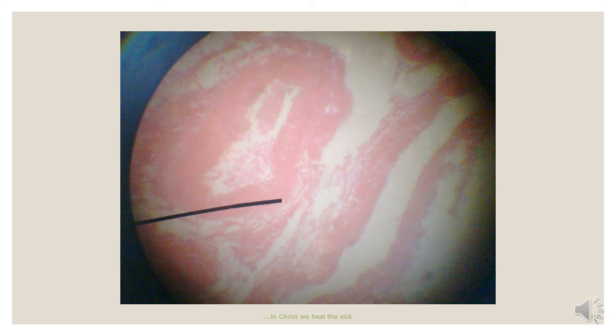This also gives a slide of both the muscular artery and the muscular vein. Here we can identify the muscular artery by its thick tunica media compared to that of its corresponding vein. Even though the lumen tends to appear compressed in the slide, it still does not appear collapsed as what we see in this particular muscular vein. So we can see how thin this tunica media is compared to this. So this is the muscular vein, and this is the muscular artery. We can even see how large the lumen is compared to what we see in this muscular artery.